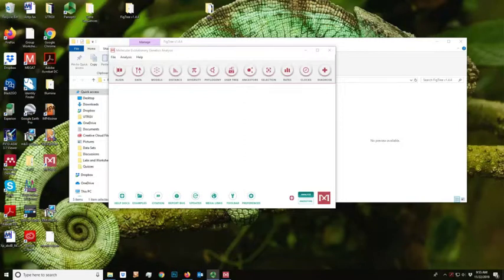Okay, so here is a walkthrough of how to make a species tree. It's a little bit more complicated than I thought. It requires 2 additional pieces of software.